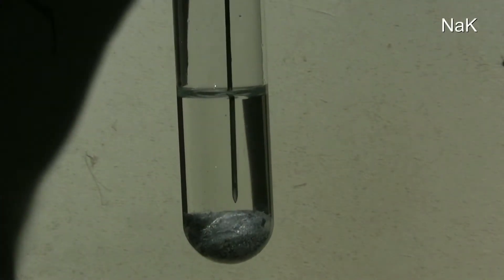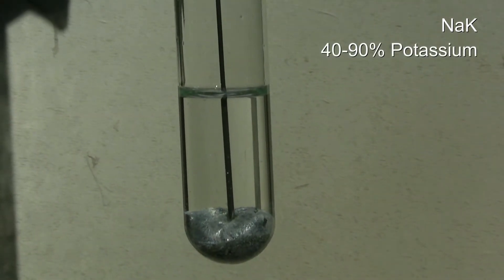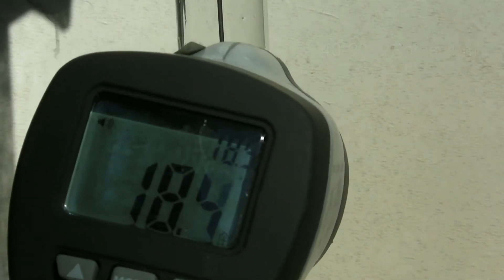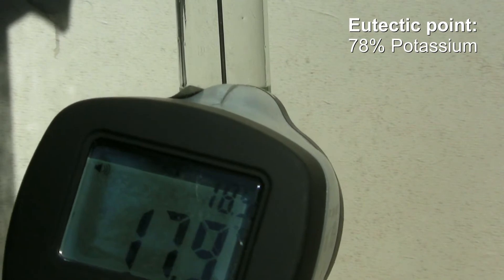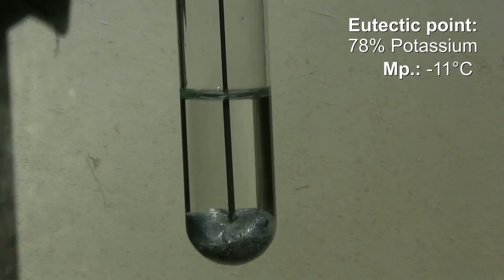This mixture is an alloy named NaK. With a content of 40–90% potassium it is liquid at room temperature. At a content of 78% it is at the eutectic point, which has the lowest melting point the alloy can reach, which is at minus 11 degrees Celsius.